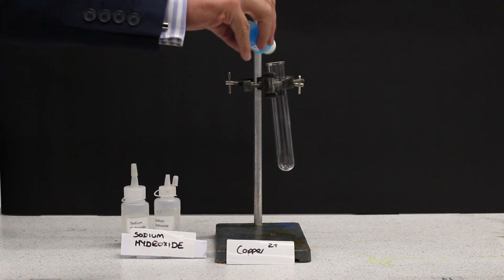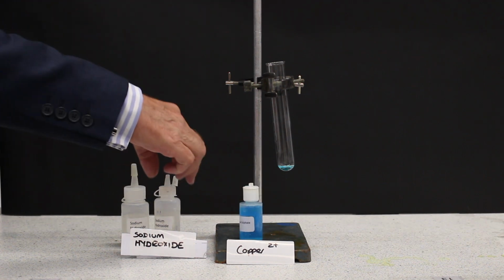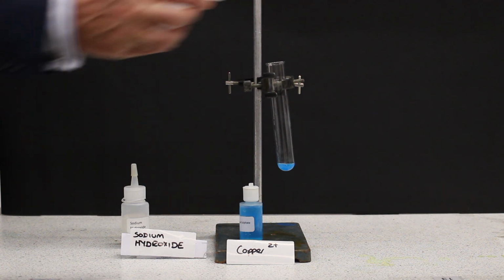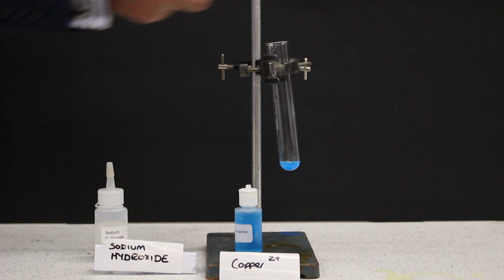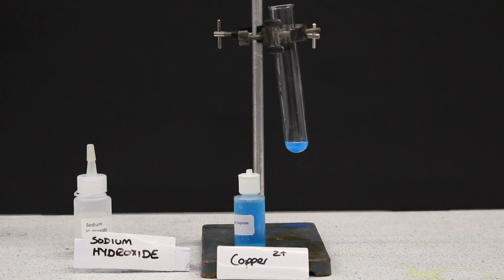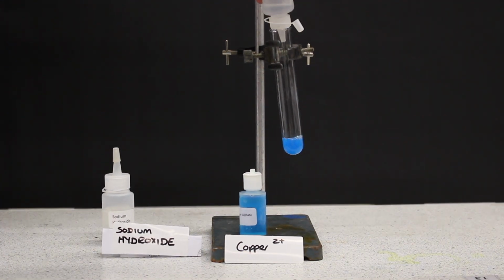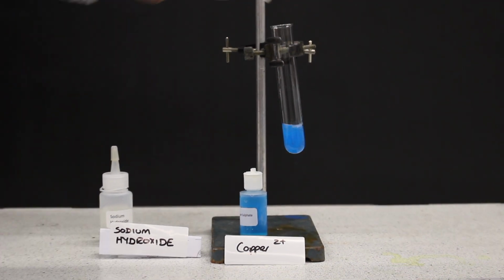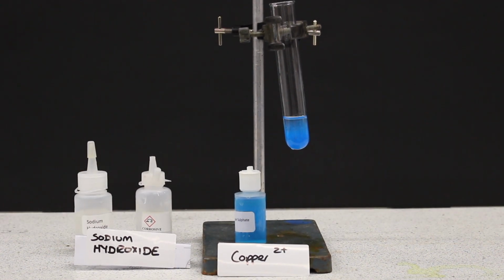So now let's look at the reaction of aqueous copper 2+ ions and aqueous sodium hydroxide. If we put a few drops of copper 2+ into a test tube and add a few drops of aqueous NaOH, we form a pale blue precipitate. And if we then add excess aqueous NaOH, this pale blue precipitate does not dissolve. So this is telling us that copper 2 hydroxide is not amphoteric.